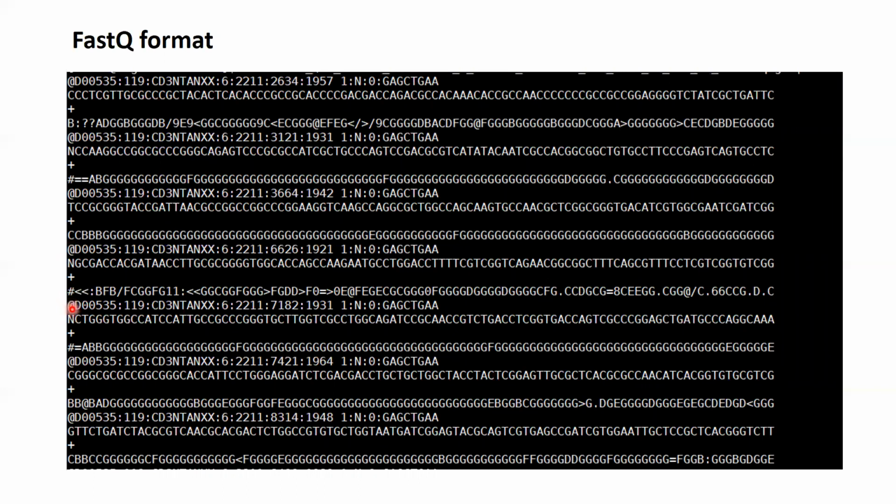And if you follow each of these read IDs, you see that the string of characters that follows them is not exactly the same as the one I have shown you before. As I said, that depends on the sequencer. So they are, in the end, slightly different formats of FASTQ files. But all of them contain the read ID, the nucleotide sequence, and the quality string.